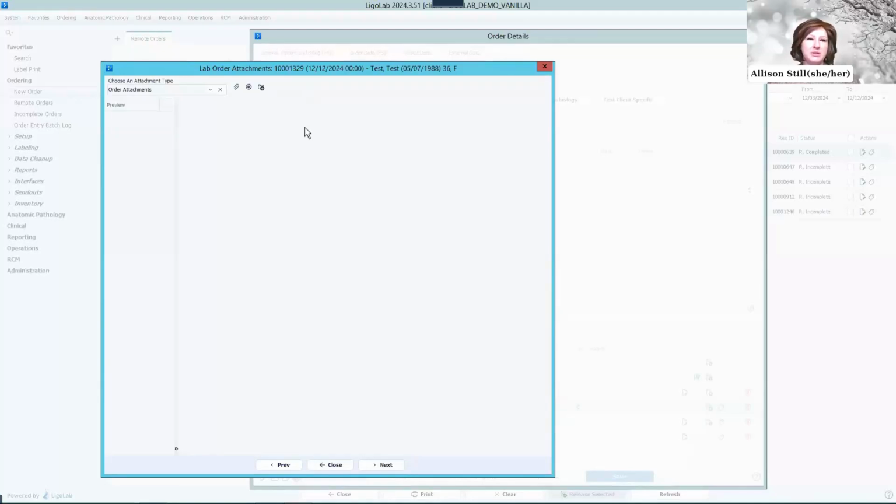But also, if that doesn't work for your lab, or what is more common with clinical specimens is batch scanning, which can happen downstream at any time. Just when you're doing the batch scanning, you want to make sure to sticker each piece of paperwork with the barcode I mentioned on the previous screen, so that when you upload those documents, the system will read that barcode and know which case to match each piece of paperwork up with.